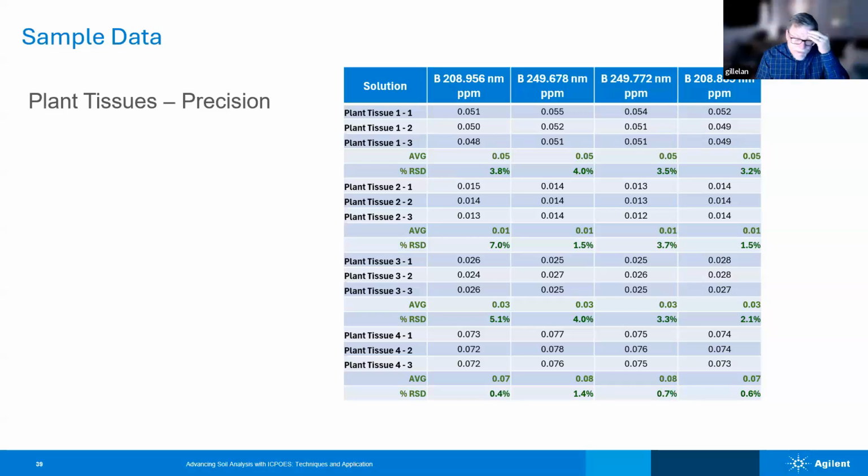Do you have any tips or suggestions, thoughts there? Now I'm on the spot. Sorry. Well, first of all, I think in the soil lab, the biggest problem is just keeping the instrument running and running properly, with the constant upkeep of the instrument, making sure that the sample introduction system is properly set up, and that your tubing is good, et cetera, et cetera.